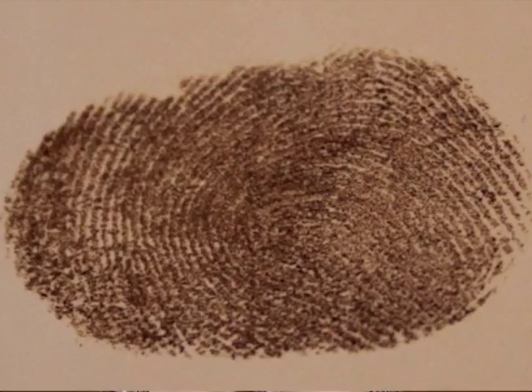Next, we will be discussing the post-treatment of developed fingerprints by the iodine fuming method. Fingerprints developed by iodine are not permanent in nature. These tend to fade out on standing. In the presence of air, the fading of prints is accelerated. For this reason, the iodine developed prints have to be photographed immediately.